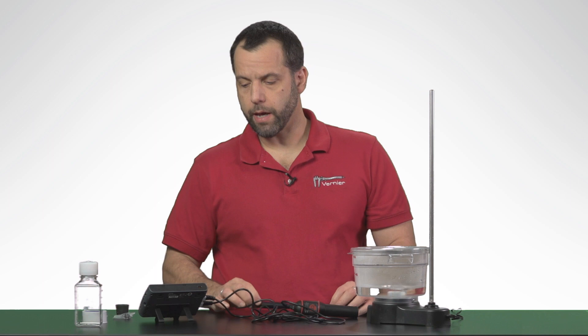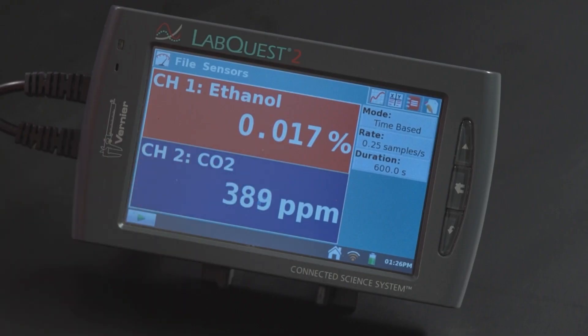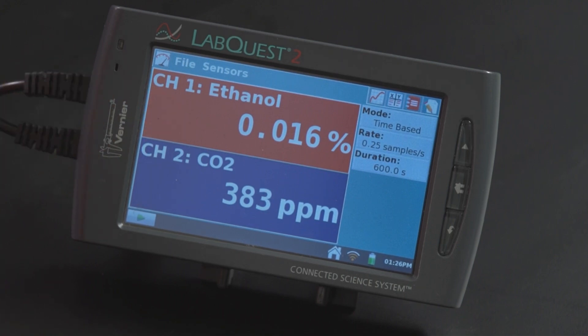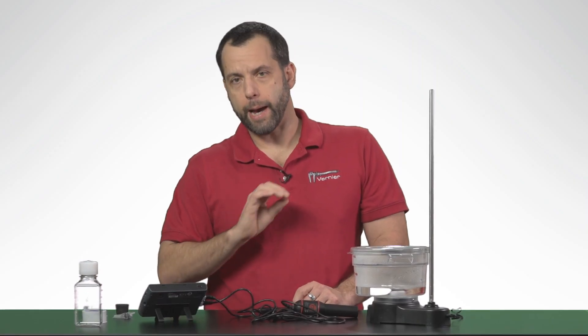This sensor itself does take about five or six minutes to warm up. I've already connected it to my LabQuest, and you can see it's reading about 0.017% ethanol. It will never read absolutely zero. That's because of the type of calibration that's used. We're using a power calibration. You will never see absolutely zero on the ethanol sensor.